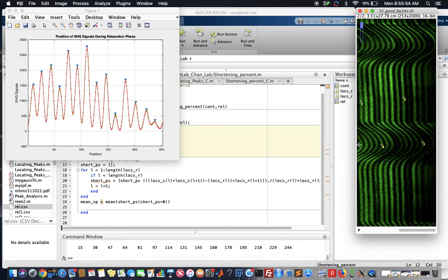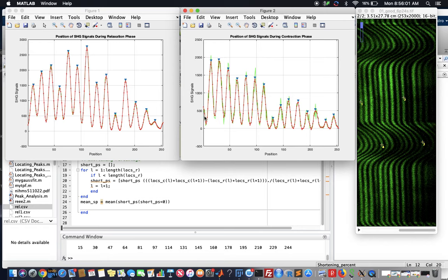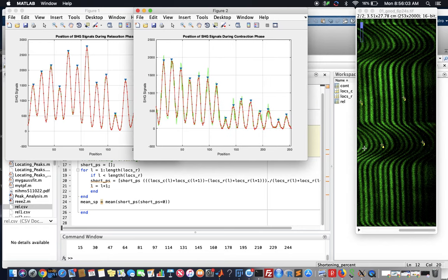So now we move on to the contraction one, and you're going to see here that there's still a slight bit of reading there. It will probably show up here as it is there. Okay. So then we're going to want to start off here at 1. So 1, 2, 3, 4, 5. And like I said earlier, this green plot in the back is showing you what the normal graph looks like, and the Golay filter is going to change this. So if you want the graph to be smoother, you can alter this number here.